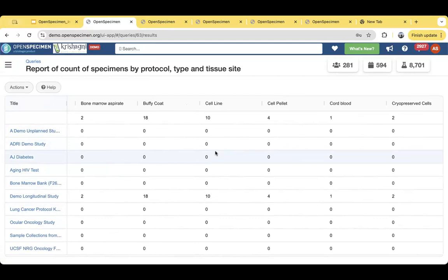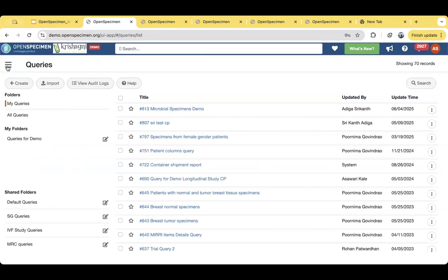For example, you can create a monthly report and say that this report should be run every month on its own on the first of the month and sent to XYZ people, so that you don't have to remember to come on every first and run that manually, send it manually, etc. So that's this one.